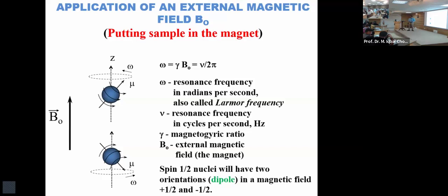So is it possible to change the direction of the magnetic field? If you change the direction of the magnetic field, you will change everything else. It has been done. For instance, in case of MRI, the magnetic field is horizontal, right? So in solid state NMR, the sample is tilted. It's called magic angle spinning. But it's more convenient to have a magnet which is horizontal. So why don't they always take the upward direction of the magnetic field?